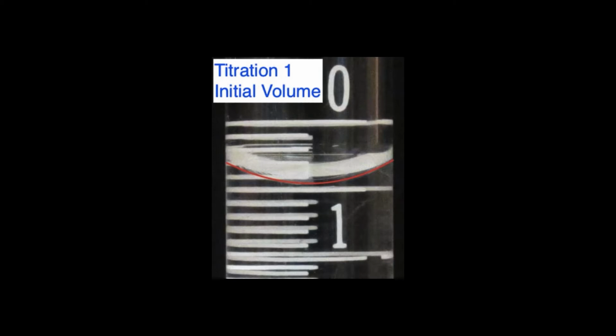So from General Chemistry 1, you've experienced this to a degree, right? When water goes into a glass cylinder, there's attractive forces that pull up the sides of the top of the water, okay? And that produces something we call the meniscus. And what I've done here, and I've done this in all the images, is I've highlighted the bottom of the meniscus. Honestly, this is easier to see than what you do in the laboratory.